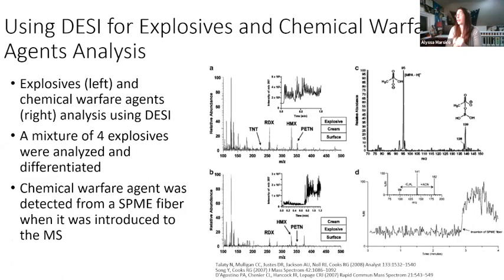We've also used this for explosives and chemical warfare agents. In this case, we used it to identify a mixture of explosives. I think what happened here was that because the explosives were such a small, fine powder, they had to stabilize it on a surface with some cream. So they put cream on it, put the powder on top of it, and analyzed this with DESI. And they were able to identify all of these agents. And we also used it for chemical warfare agents.